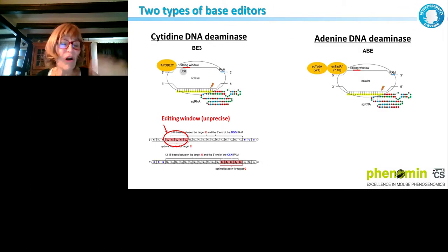Cytidine deaminase is great because it's linked to this deaminase called APOBEC1, and it has a specific editing window. As it doesn't cut, APOBEC will just modify the cytosines that are located, in theory, in this editing window.